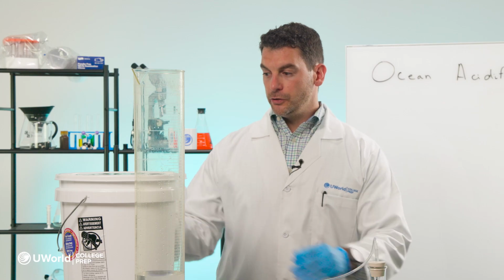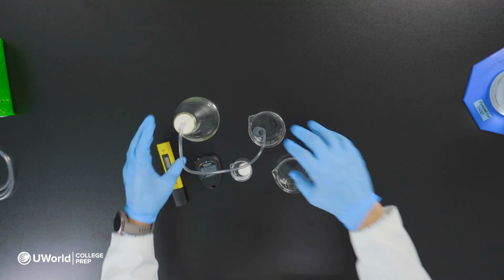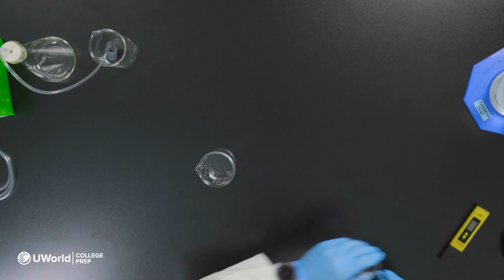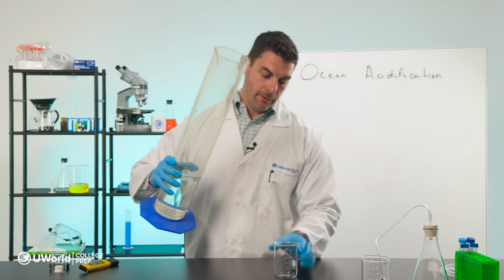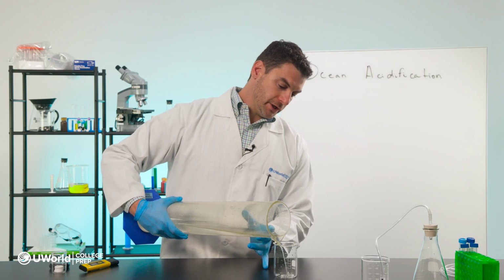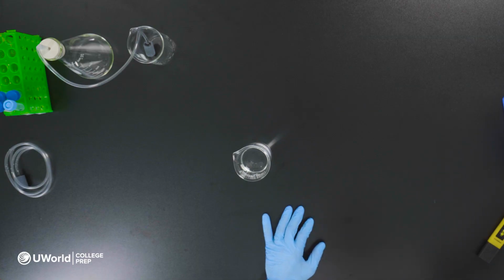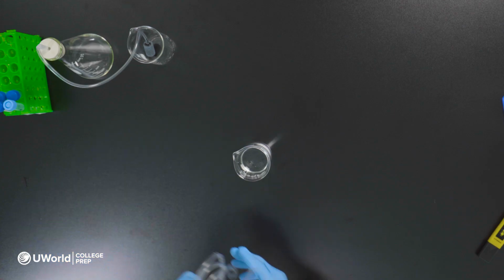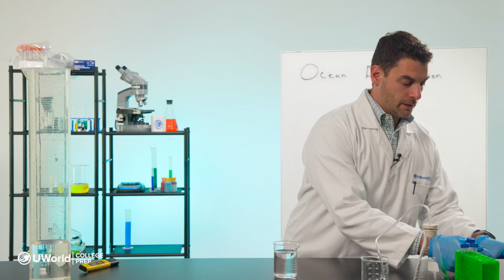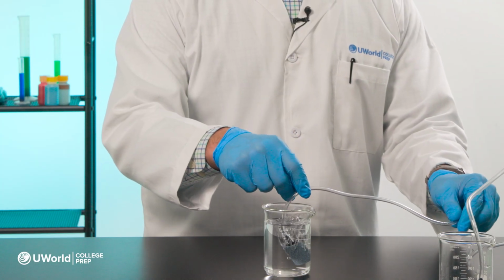So the first thing we need to do with all of this is set up our control apparatus. So in this first setup, all we need is our beaker, and we'll add about 200 mLs of distilled water. And I'm using distilled water just to make sure that there are no ions or any buffering capabilities within that. Once you have that, you take your tubing with the air stone and you connect that to your air pump.